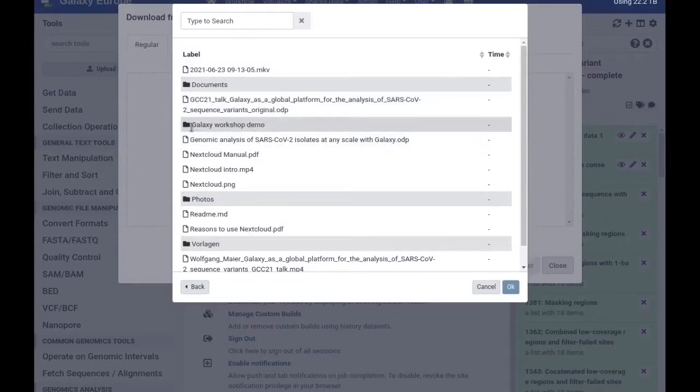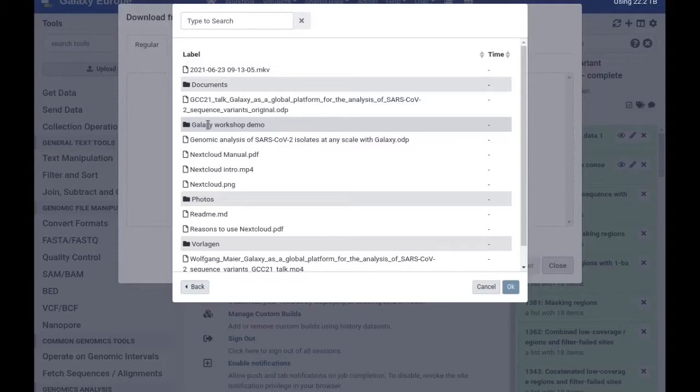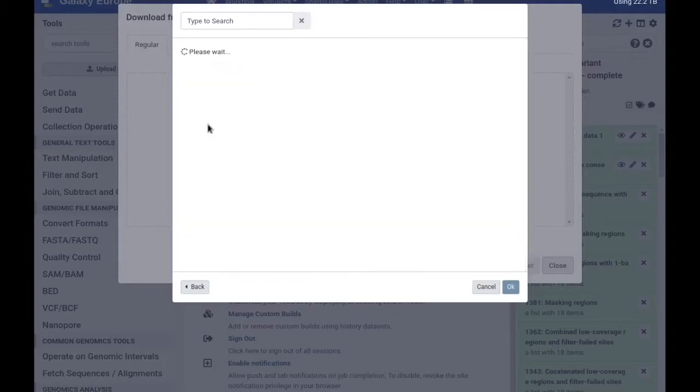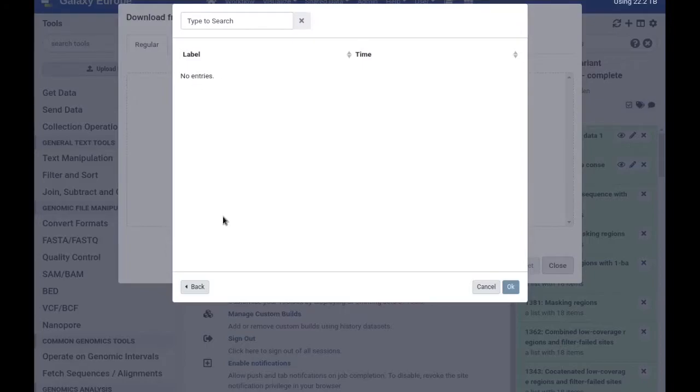For example, I'm seeing here a folder called Galaxy workshop demo which I generated on this Nextcloud instance before the workshop. I can go inside there and then disappointingly I find there's nothing in here. But if there was data I could upload it now into Galaxy.